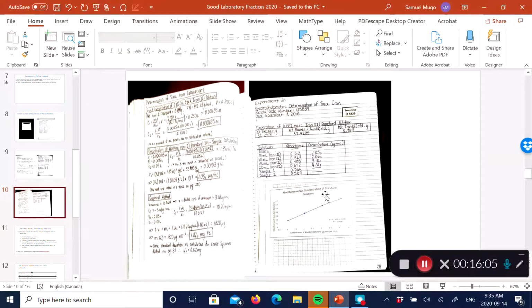Similar to this again, I think this one was spectrophotometric determination of trace iron, which will be your first lab in the 3rd week. Again, you can see the date should be there, and the sample code should be very clearly taped or glued in there, or written in a very legible way. The data that was initially collected in the lab should be indicated there. You've got the calculations, and you've got the output, in this case the Excel calibration graph, glued onto the lab notebook. So again, you can see the completeness of how you should record data, calculations and results in your lab notebook.